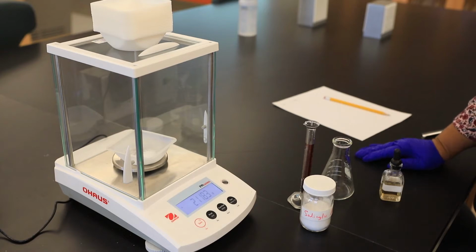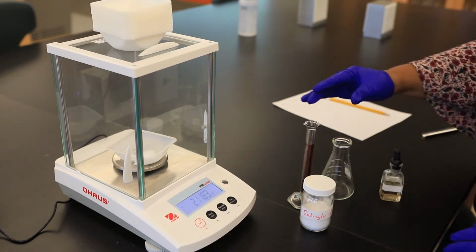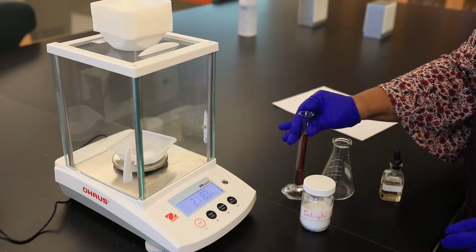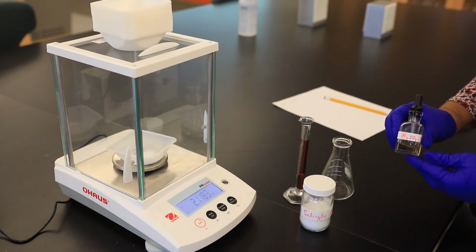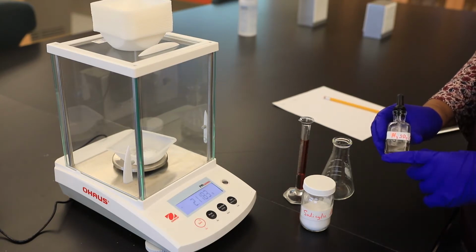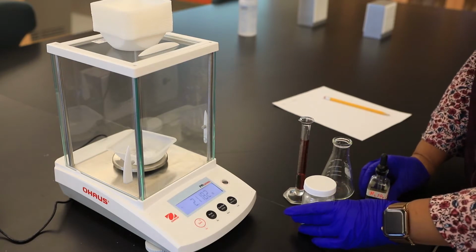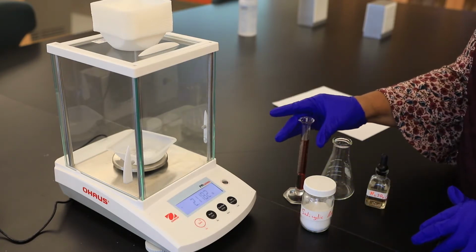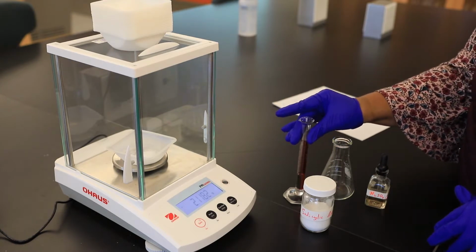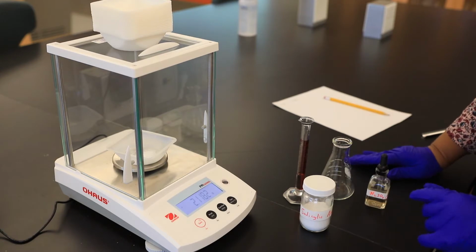So for the synthesis of aspirin, we will need, of course, salicylic acid. We'll also need acetic anhydride. And in order for this reaction to occur during the required time period, we're going to be using sulfuric acid as our catalyst. Just keep in mind that acetic anhydride is actually in excess, and therefore our limiting reagent in this experiment is salicylic acid.